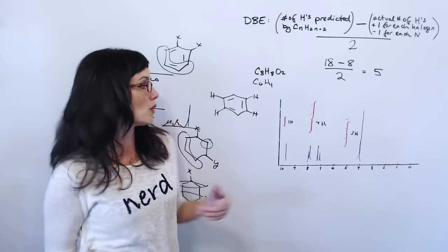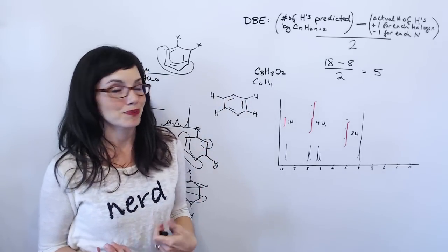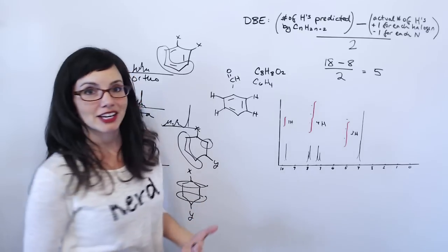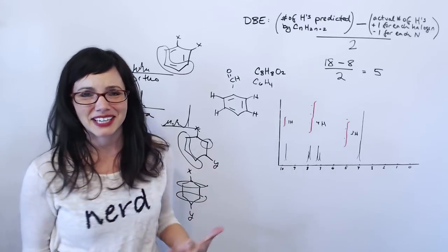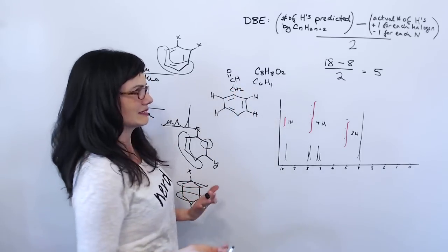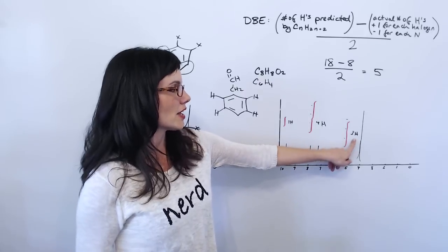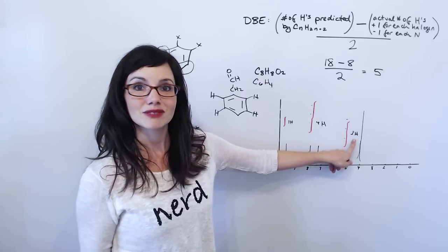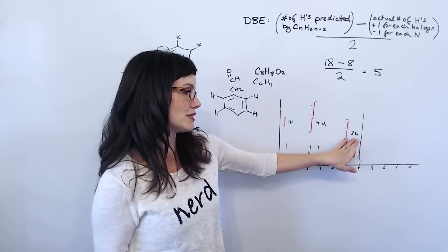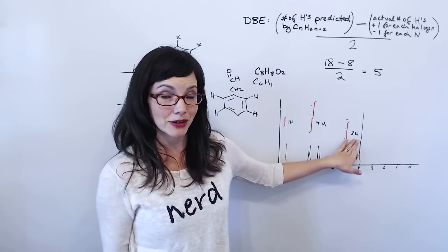Now we've got to figure out what these 2 substituents are. We know we have an aldehyde group, so we could kind of guess that there might be an aldehyde group here. But what if that aldehyde group is at the end of a chain? Like, what if there's a CH2 here? We don't know, right? But check this out. 3 protons made this signal. That's probably a CH3. Almost any time you see an integration of 3, you probably have a CH3, a methyl group, making that signal.